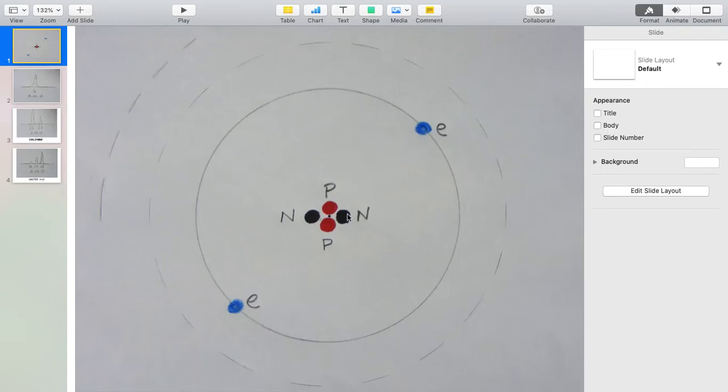But there is an additional effect which can be measured, and that is that there is energy which holds these protons and neutrons in the nucleus together. In chemical reactions and in mass spectrometers, we fiddle about with the electrons, but under normal circumstances nothing disturbs the nucleus. There's a lot of energy that holds all this together. Now this energy has to be accounted for, and so the fact that there is this energy stored up in the nucleus causes the mass to be different from just the mass of the protons and the neutrons.